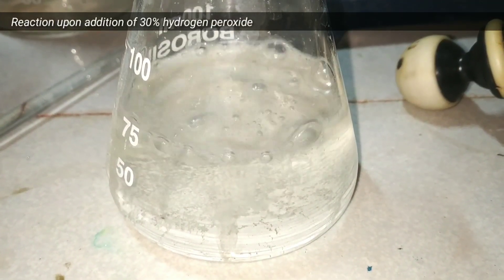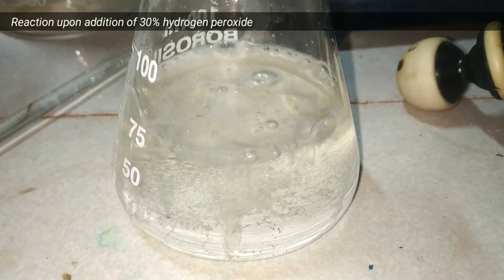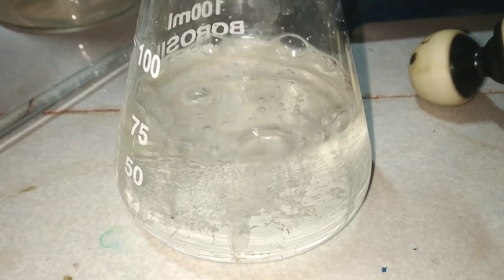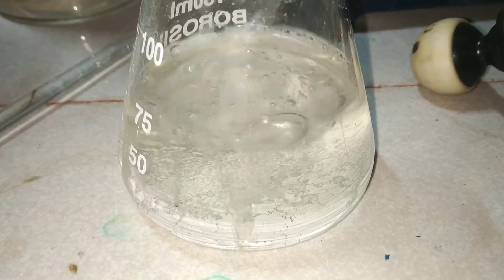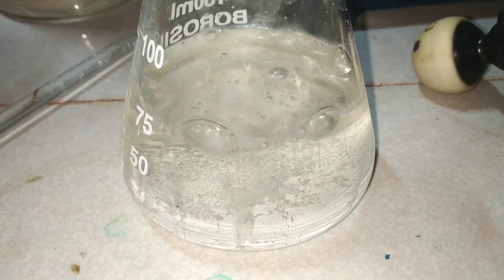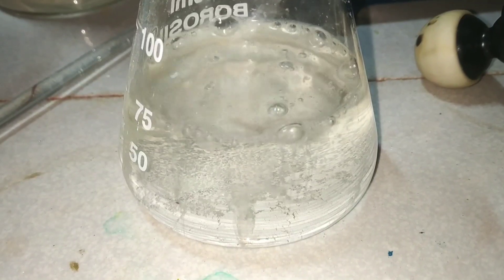So I decided to add some 30% hydrogen peroxide solution to make all the mercury 1+ to mercury 2+. And as you can see, all the mercury oxides have now dissolved in the solution and the solution has now turned clear.